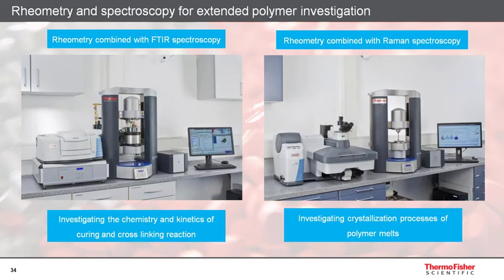For a deeper understanding of structure-property relationships, usually more than one analytical technique is required. When combining rheometry with other analytical techniques, additional information can be obtained. This allows for an extended investigation of a material and provides a more complete knowledge of its characteristics.